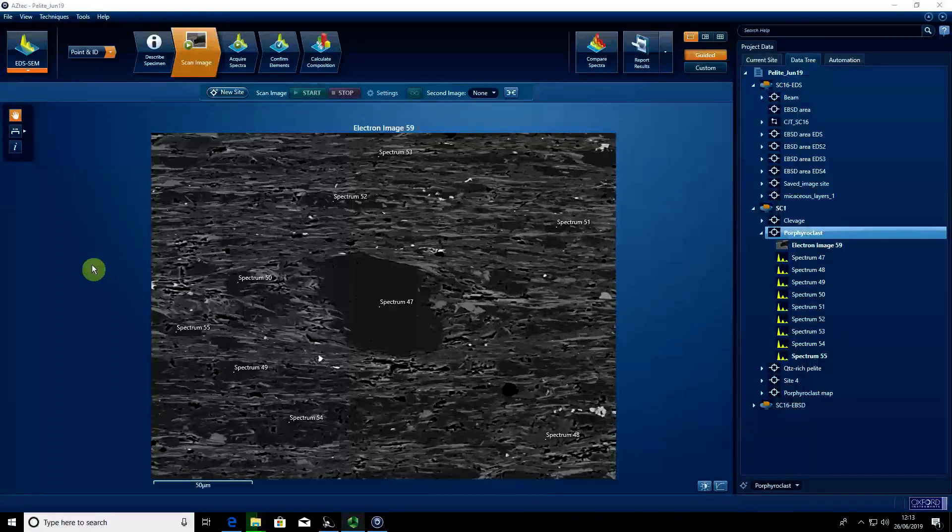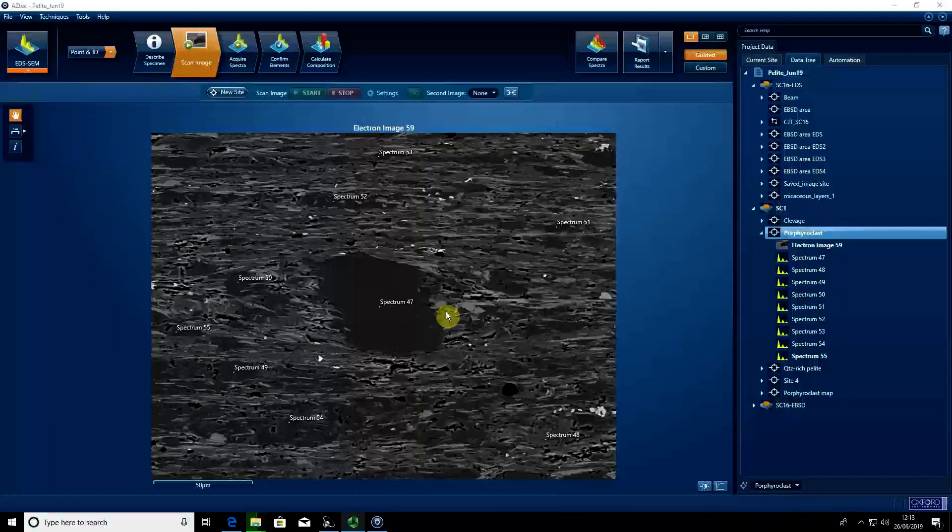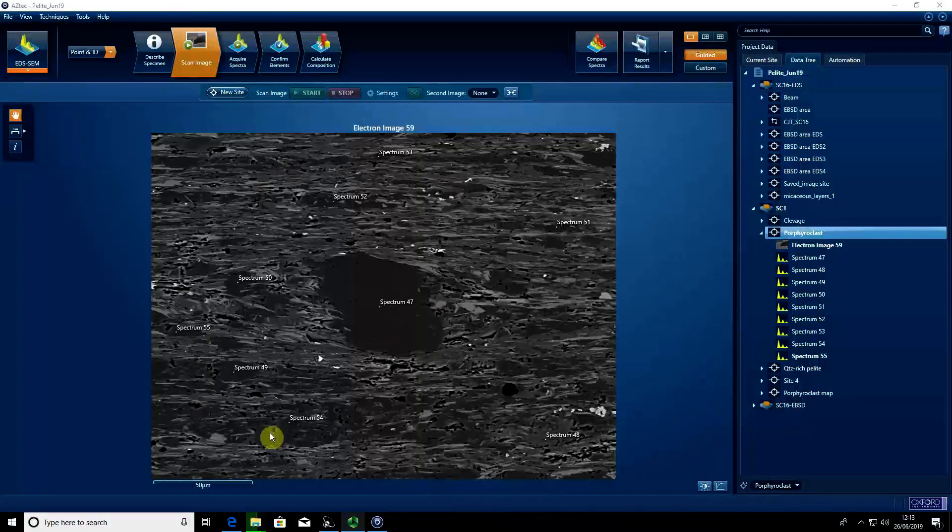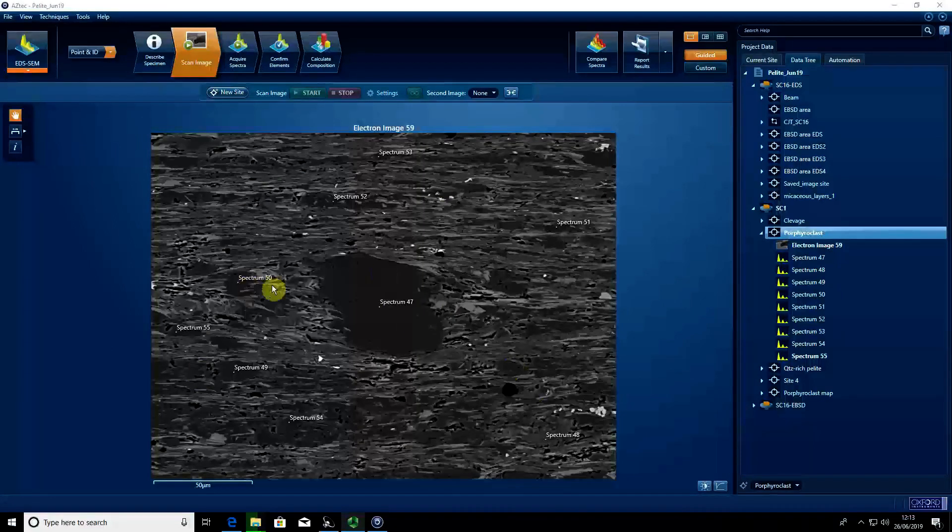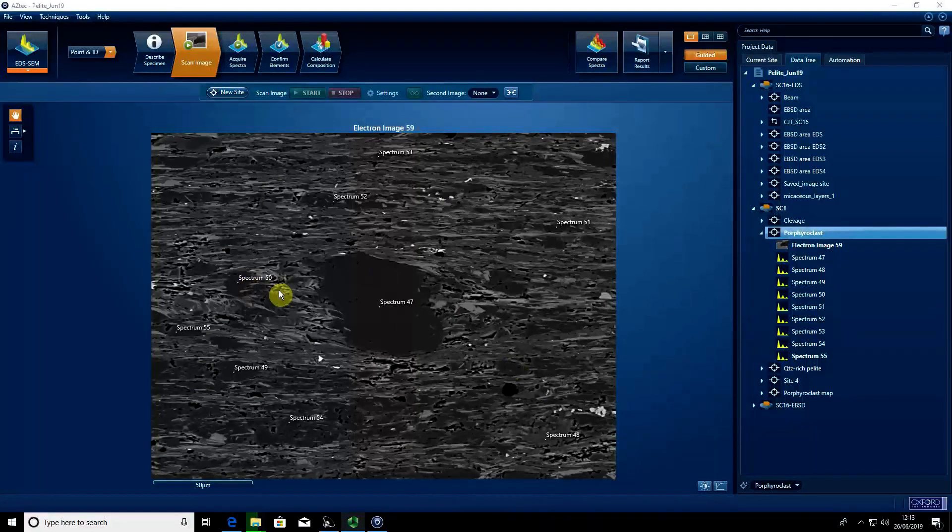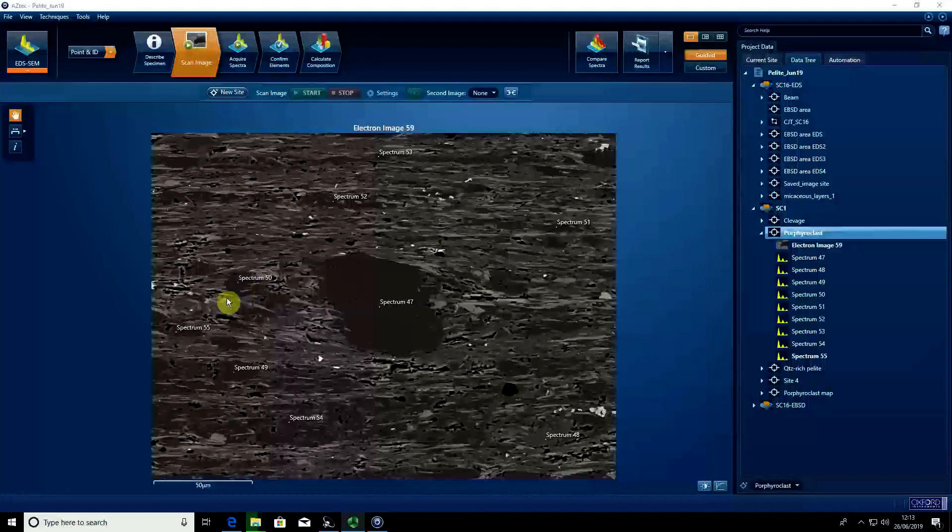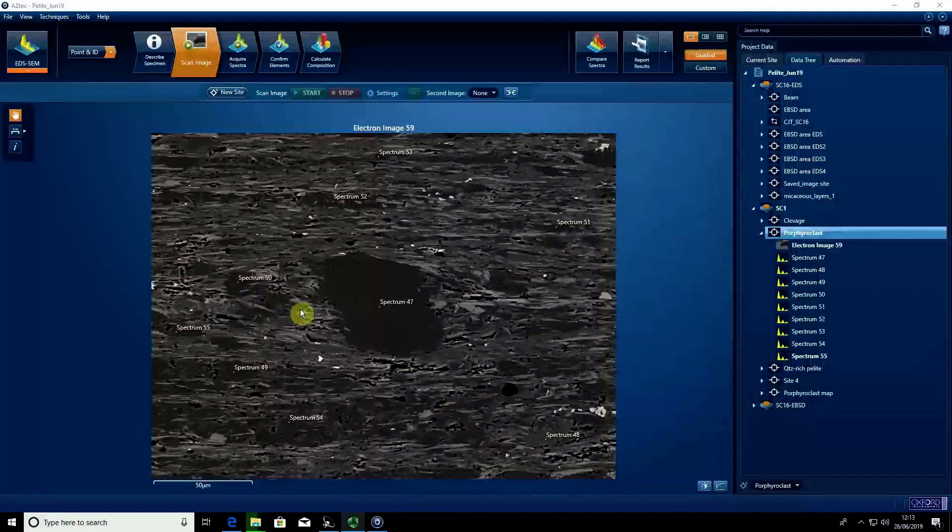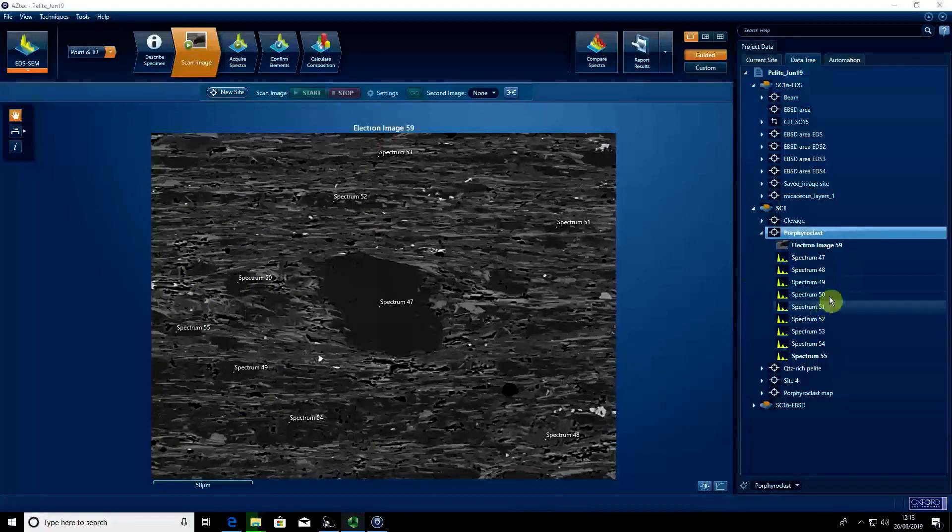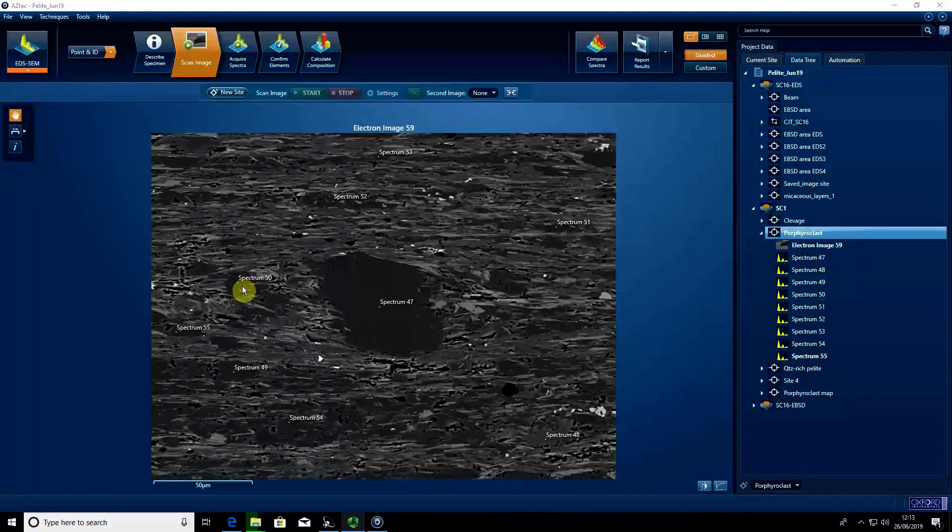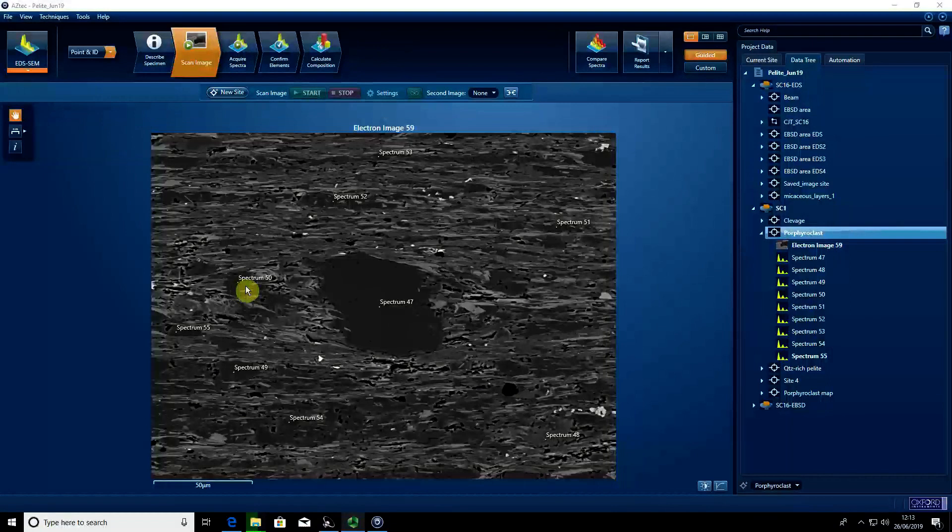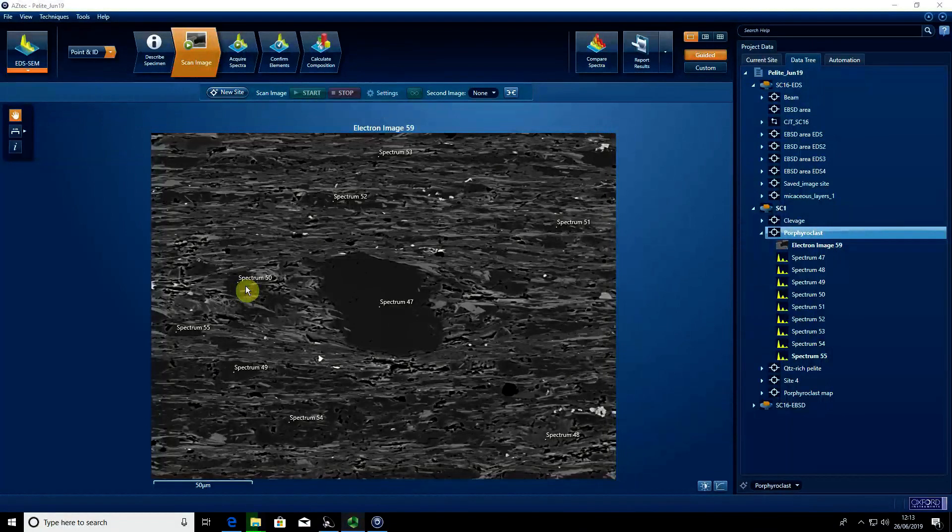Most users will want a blank image showing the actual texture of their rock without annotations, but also another image showing where spectra were taken, so you can link the spectrum number to the actual location where that spectrum chemistry relates to.